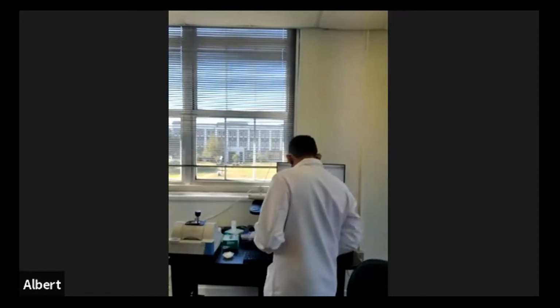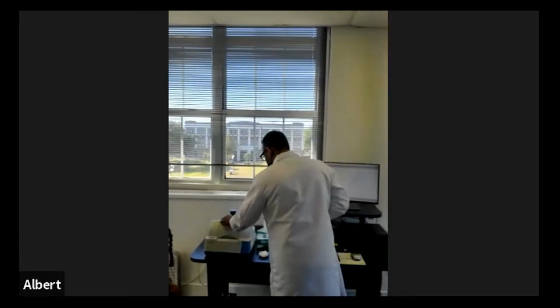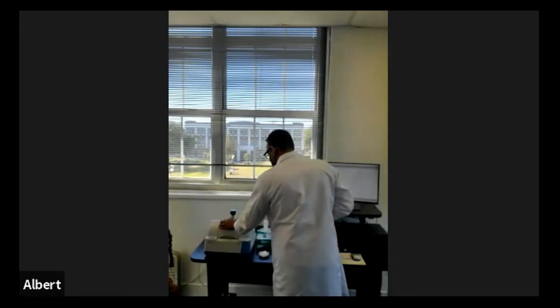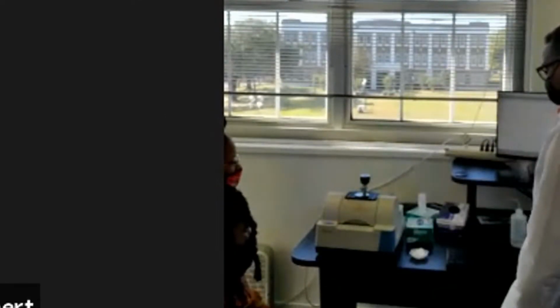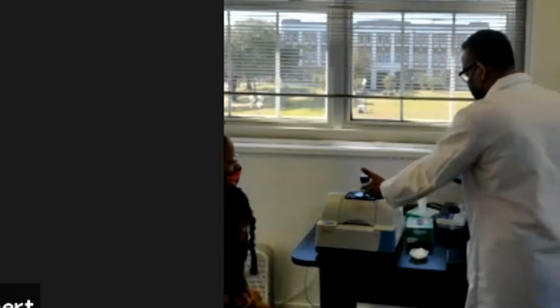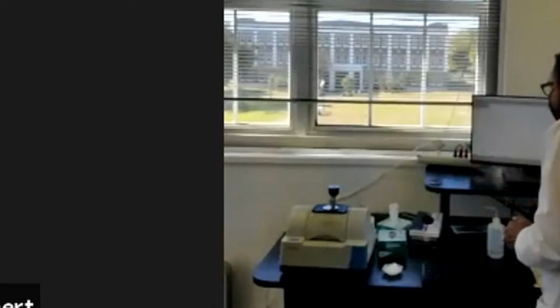Okay, guys, so we're going to run sample number 2. We clean the stage. We make sure the diamond where you put the sample in is very clean. We're running a background for this sample, because you want a background of all the peaks for the moisture and carbon dioxide that should be taken off, subtracted out from the sample. So the peaks you're going to see later will be only due to your sample.